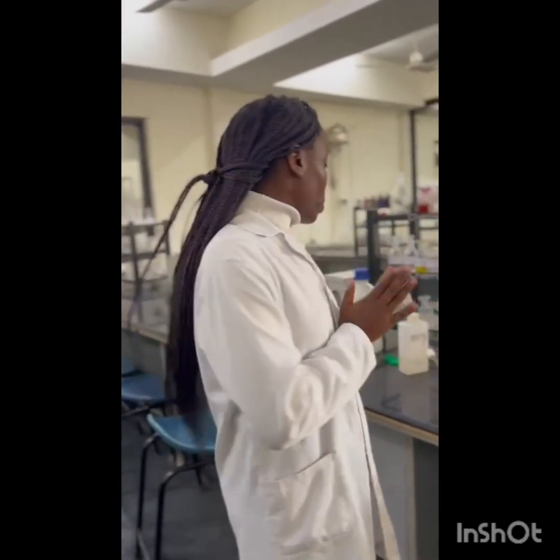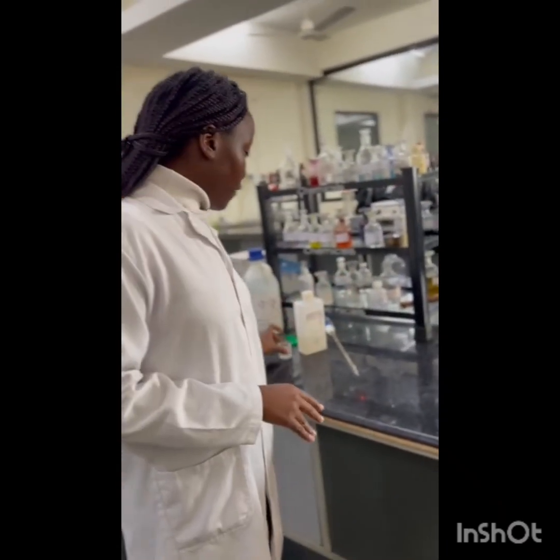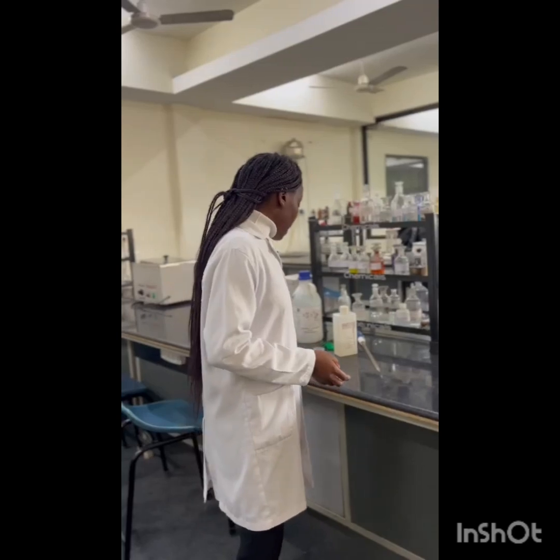But the problem is that I don't have a bony tissue here. So just for the sake of showing you how it's done and what needs to be done, I'm just going to use the tissue that I have. If you remember what I said, first you need to make sure that your tissue has been fully fixed. There are different fixing methods, but make sure that you don't use acidic fixation. So maybe you can use formalin, neutral formalin. This one is fixed in neutral formalin, and it's already ready for decalcifying.